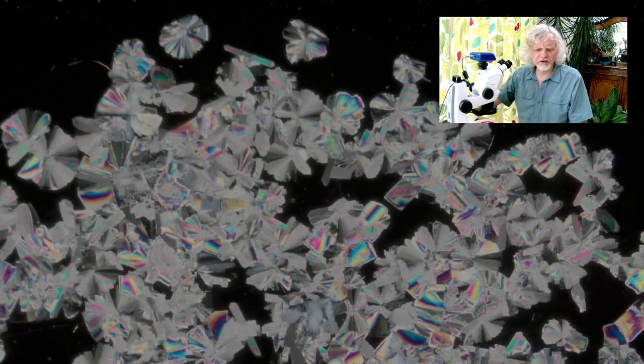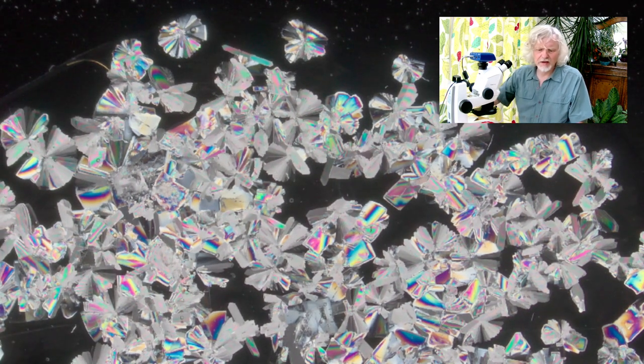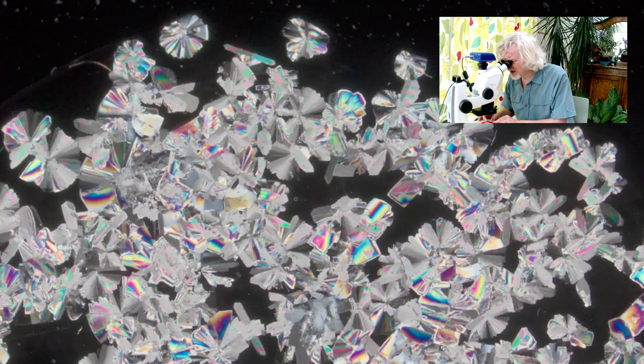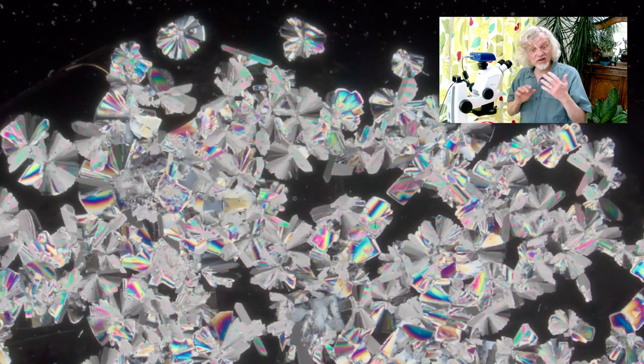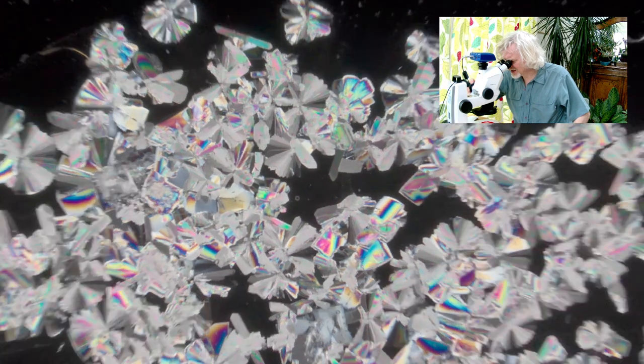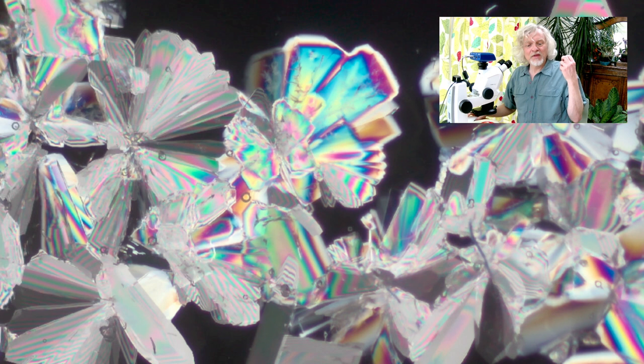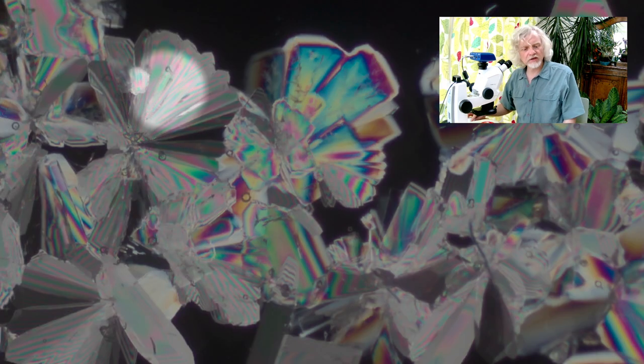And if you leave that for long enough, you end up with this, which is really rather lovely. I've got the autofocus on just because that helps with this sort of sample. And I'll just make sure I'm completely at extinction. And now you can start to see some of the fun colors as well. Because depending on the thickness of the crystal, you get different colors. So I'm going to zoom right in on this. And this bit's quite fun over here, look. And you can see. Look at those. Aren't they pretty? And you can see here, this is quite good. You can see the crystals growing out.